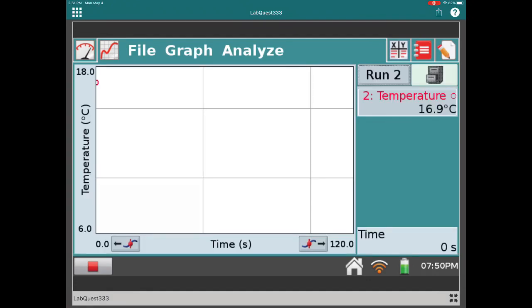We're going to let the temperature sensor record the first few temperatures of the alcohol just sitting on the countertop. Next, we'll take the sensor out of the beaker of alcohol and lay it on the countertop with the tip of the sensor hanging off the edge of the counter. Then the alcohol will be evaporating slowly from the filter paper, and we'll see the change in temperature over time as it evaporates.